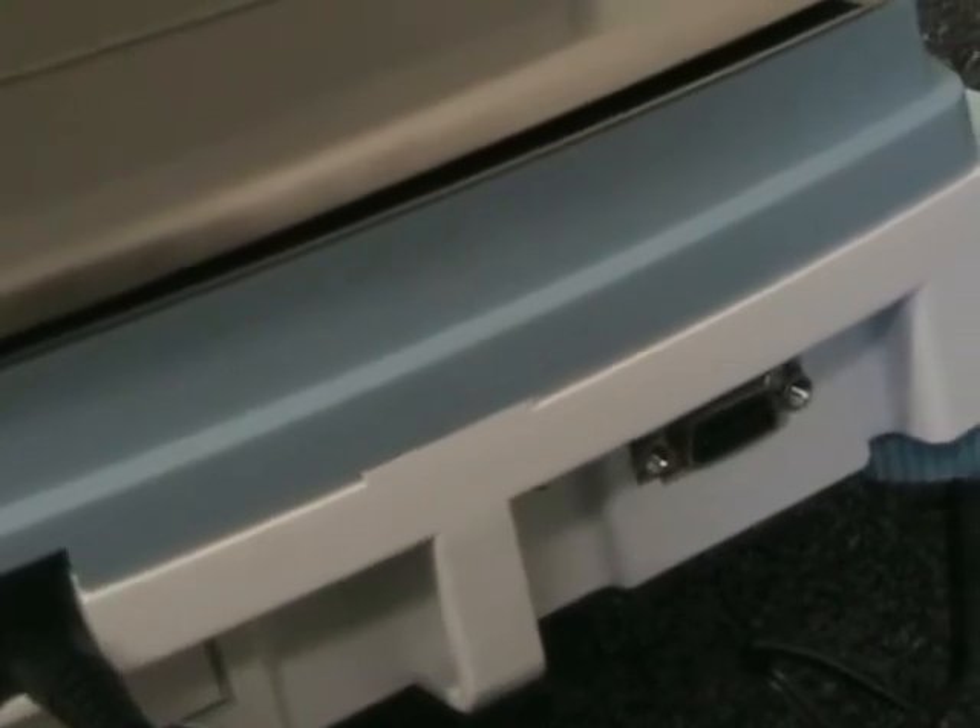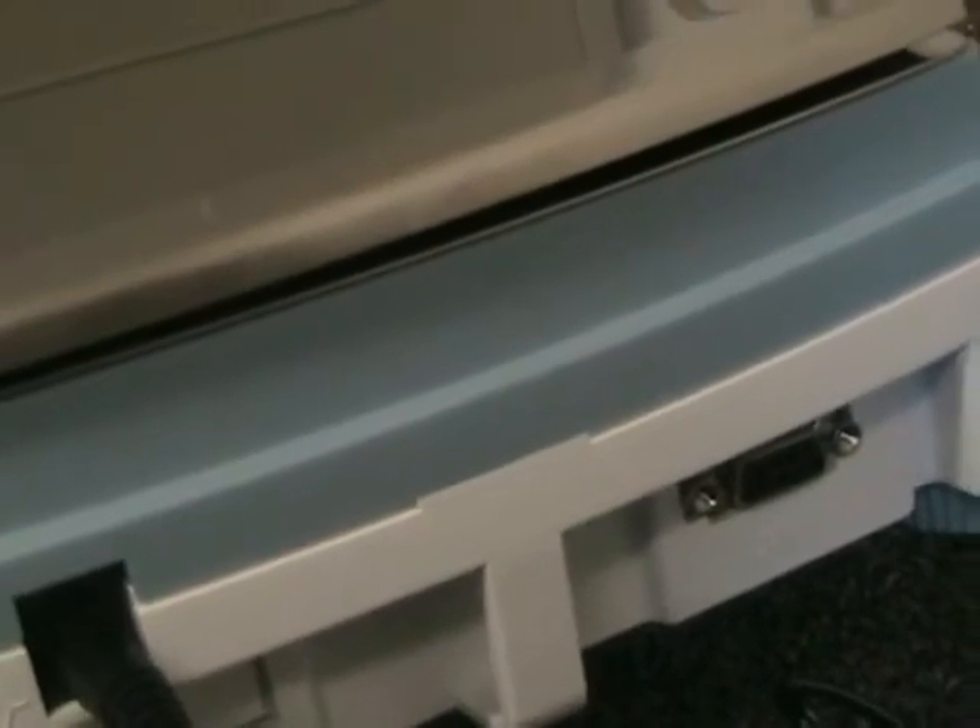The O-House Adventurer Pro balance is designed for use in laboratory, industrial, or education applications. The O-House Adventurer Pro continues the tradition set by the original O-House Adventurer series.